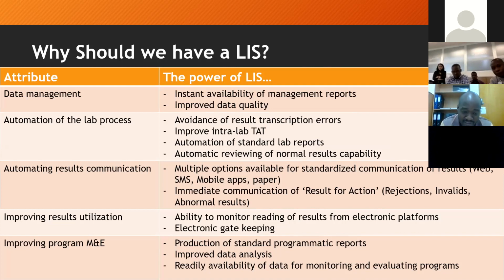With an electronic system and LIS, you can also immediately communicate results that require action, like rejections, invalids, and anything that is abnormal. There's also improved utilization of results, because you can monitor whether results are being used by facilities or not, and if not, you can be proactive and act on it.